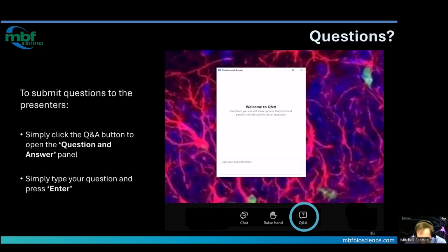Yeah, I was going to bring that up. Once you've done that alignment, then the idea is that all of the sample positions that you might have saved for mosaic or maybe cycle style scanning, you can reuse those sample positions. So save those mosaics or cycles to file and then load between sessions on the microscope. You can account for a 2-degree shift of your sample more easily now than before.